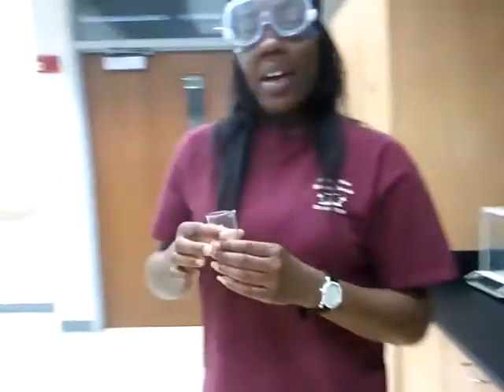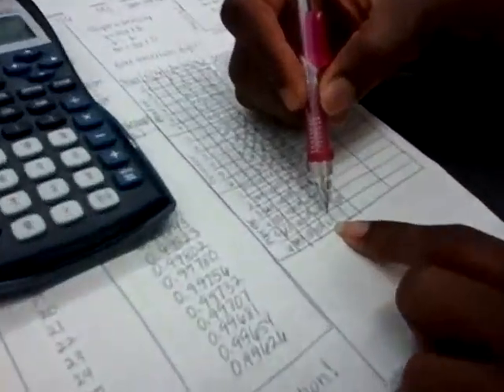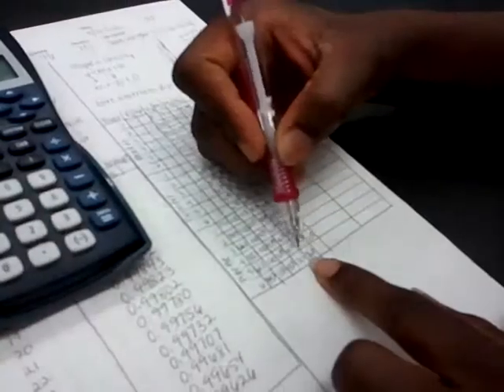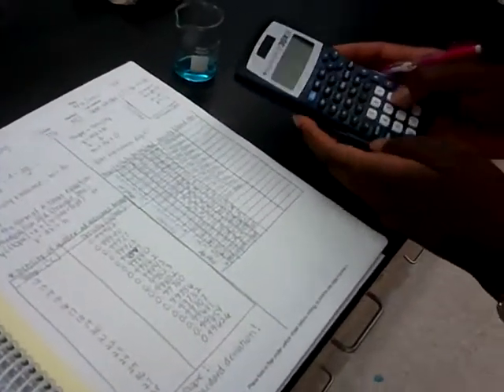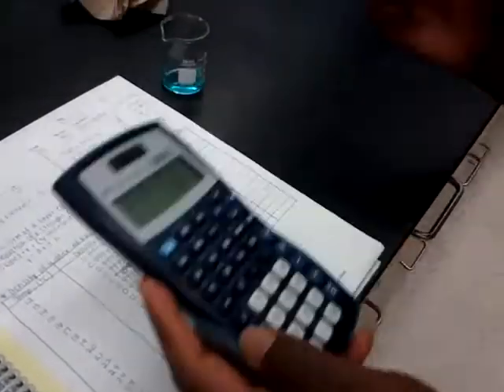Now let's go record our actual value. Alright. So like I said earlier, we got 31.12 as our initial mass. Now with our value we have 36.51. So we'll take the difference of those two so we can find our actual mass, which is 5.39.